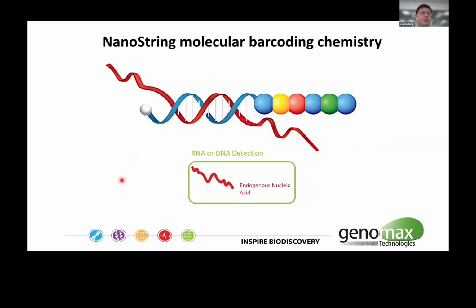One of the main differences for the Nanostring nCounter platform compared to other conventional platforms for gene expression studies, like NGS, microarray, or qPCR, is that nCounter directly works with total RNA. So basically, you just extract your total RNA from either a tissue or cell sample, and then do a NanoDrop reading to find out the concentration and also the 260/230 and 260/280 ratios. If they pass the requirement, they can be directly used on Nanostring. There is no need to do cDNA synthesis to convert to DNA, and no need to do amplification for the detection. So it works directly with total RNA.